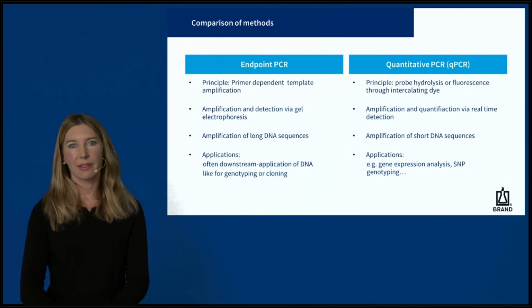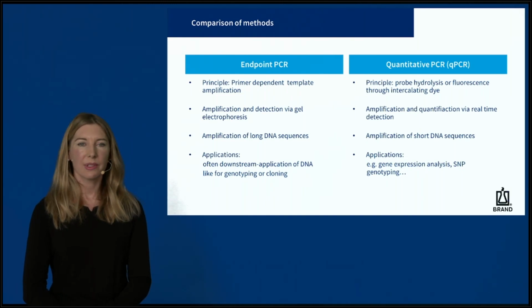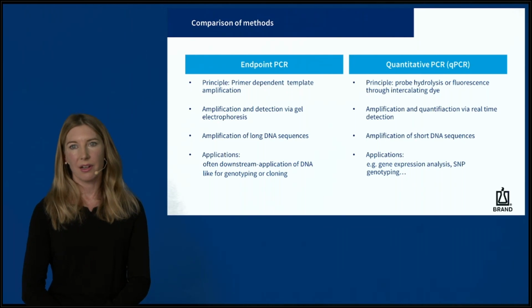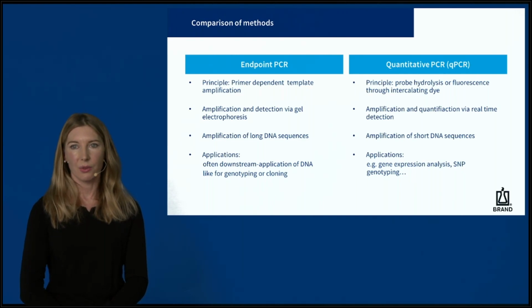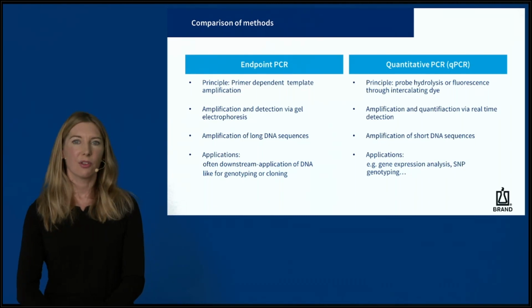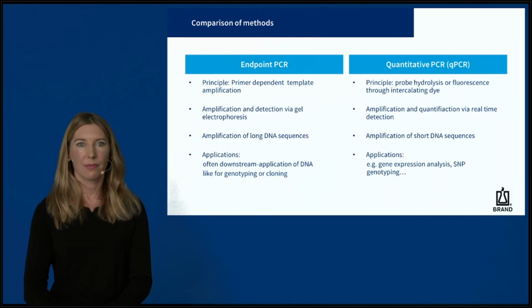Different PCR methods can be distinguished. Standard PCR or endpoint PCR allows a qualitative to semi-quantitative analysis after the sample is applied on the gel of the gel electrophoresis. Thanks to the uniform sample preparation, standard PCR technique is simple to understand and to use. Furthermore, it is a quite cost-effective technique. Amplification of long DNA sequences up to 3,000 base pairs is possible.